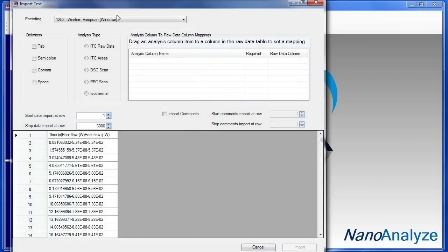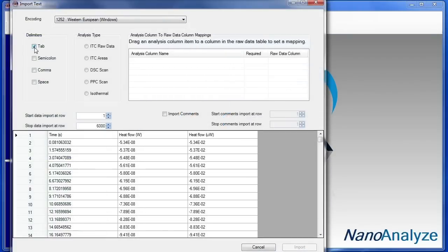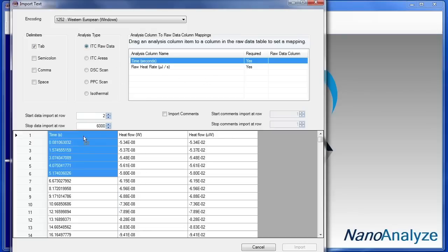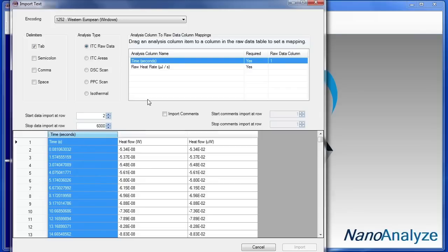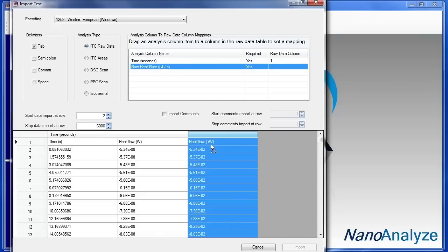From here, a wizard comes up. The delimiter was a tab. And we want to start the data import at row 2. It's ITC raw data. And this is our time from the TAM. And this is the raw heat rate from the TAM. And from here, choose Import.